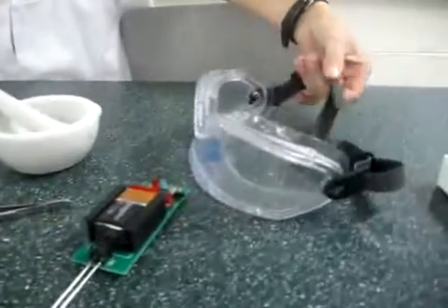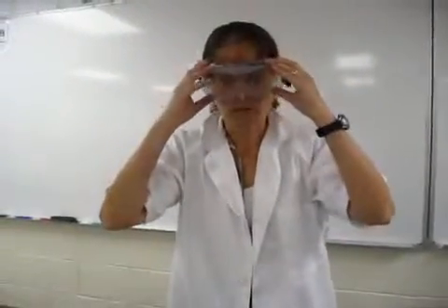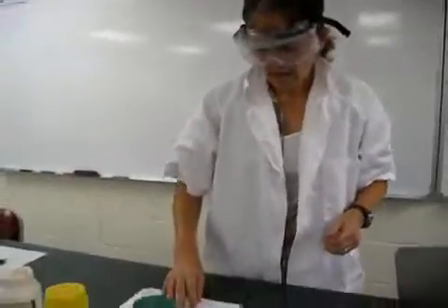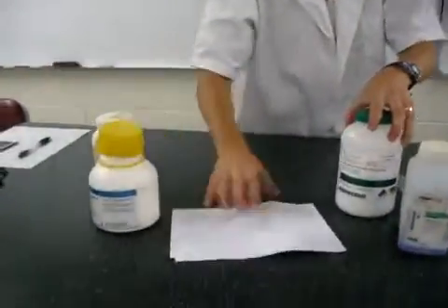Of course, you will begin the procedure by putting on your safety goggles. Safety first. Next, you will want to create an observation table to record your information. Notice today that you will be testing 4 compounds for their color, texture, luster, brittleness, solubility, and conductivity.